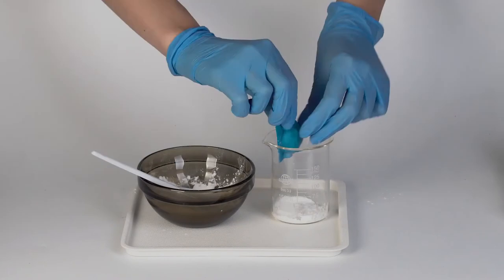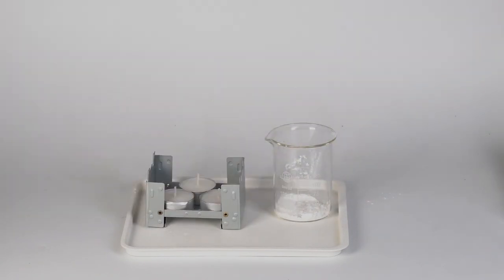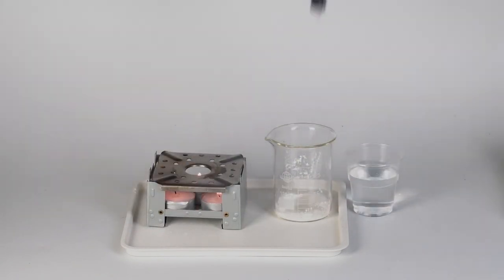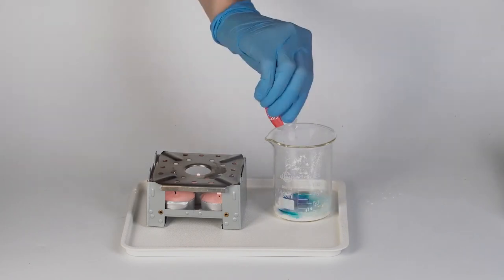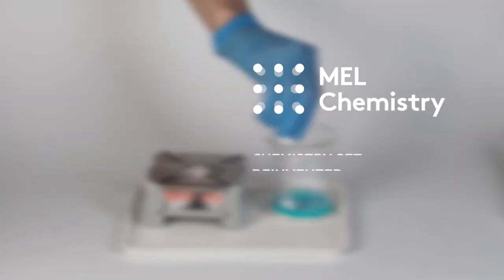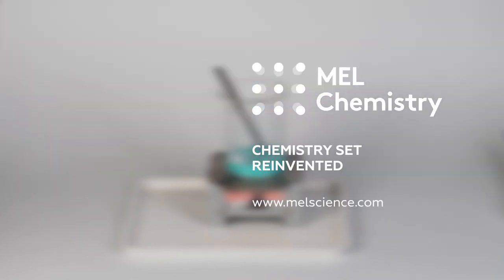You can also use powdered starch that can be found in artisan and organic shops. In this case, you should start the experiment directly from the heating of the mixture. Learn more about this experiment on our MelScience website.